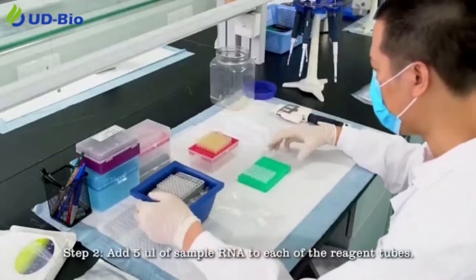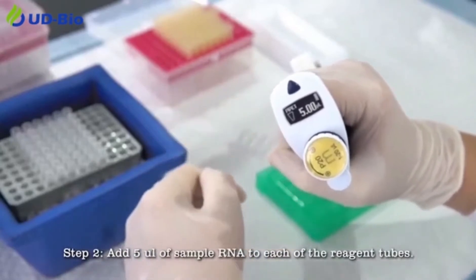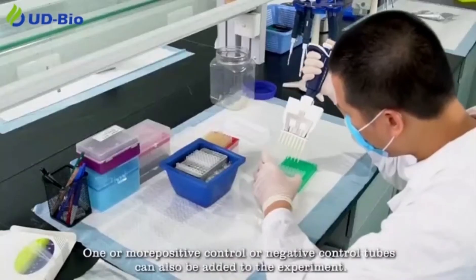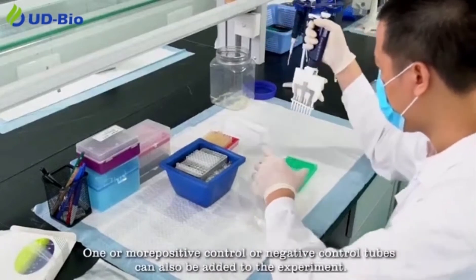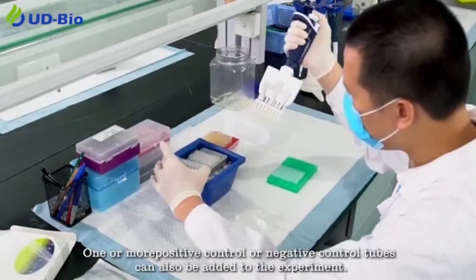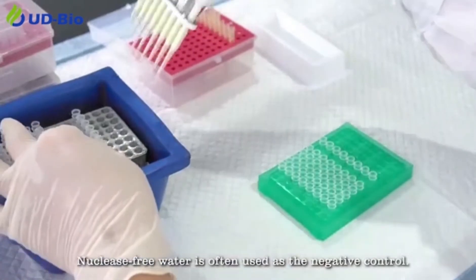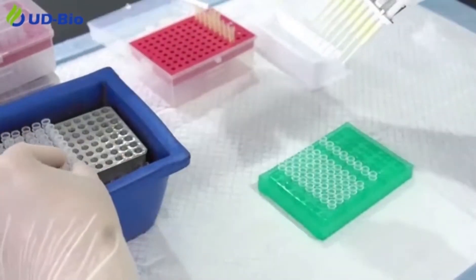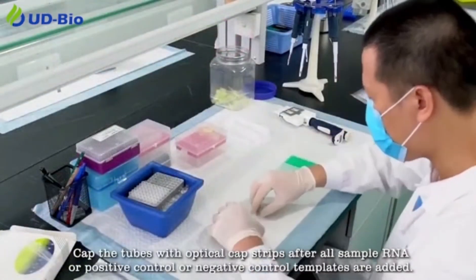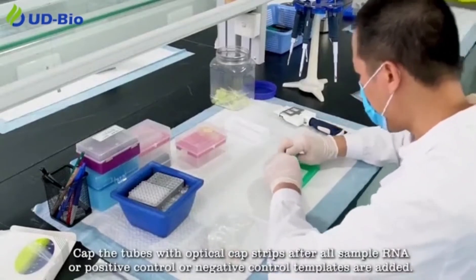Step 2: Add 5 microliters of sample RNA to each of the reagent tubes. One or more positive control or negative control tubes can also be added to the experiment. Nuclease-free water is often used as the negative control. Cap the tubes with optical cap strips after all sample RNA or control templates are added.